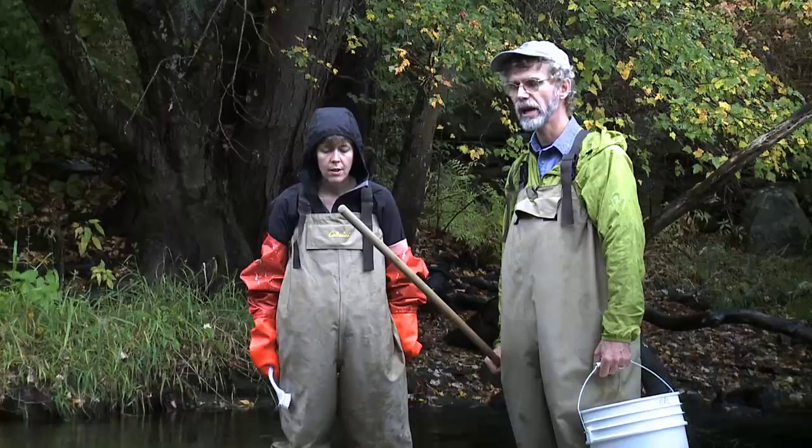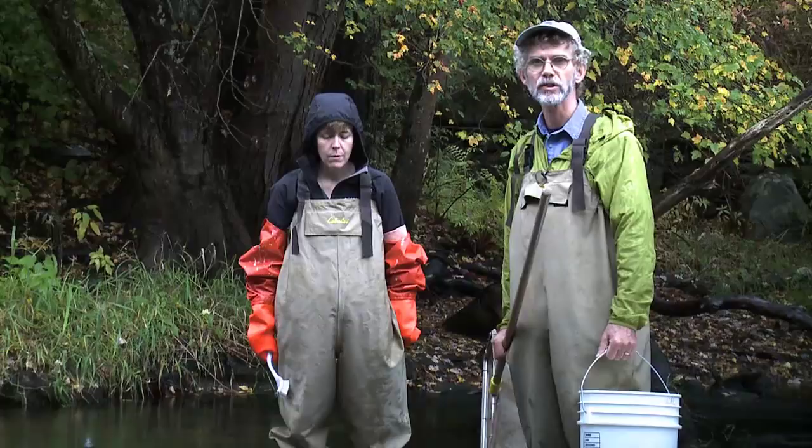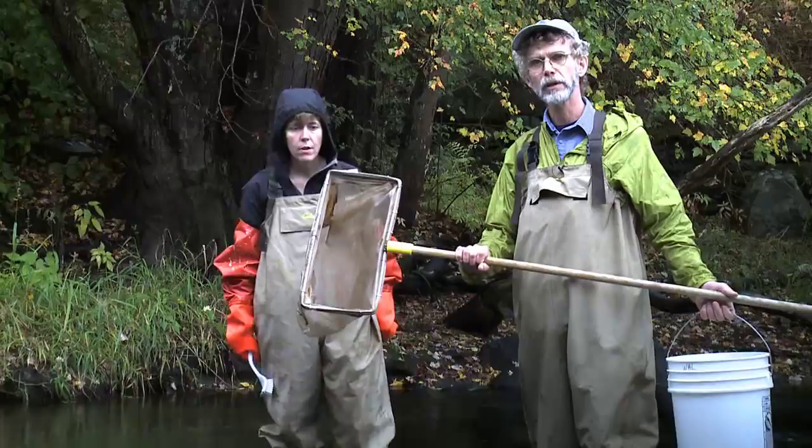Good morning. Part of our bug watch modules in the Watershed Access Lab is to teach you how to sample aquatic invertebrates in flowing river situations. So Kim and I are going to show you the basic technique for sampling aquatic insects — two in fast moving water and two in slow moving water. We'll just do the fast moving water this morning.